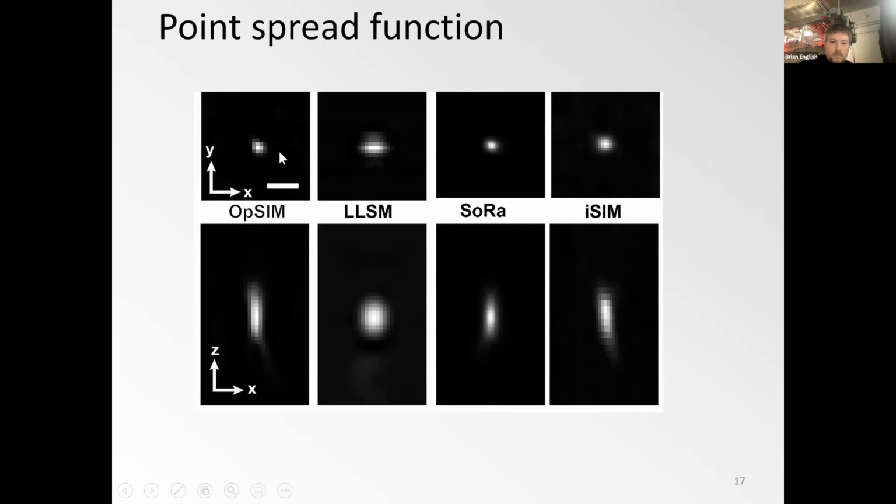We haven't indicated the values; we put them on bioRxiv. I should add them, but the resolution of these kinds of photon reassignment techniques is similar. So you could argue, okay, why not just use the SoRa or the ISIM, which was shown later. This is still in a light sheet format, so we hope to get the benefits of light sheet, such as low bleaching and fast acquisition rate, in contrast to the spinning disk or instant SIM.